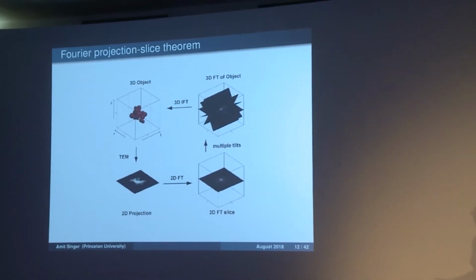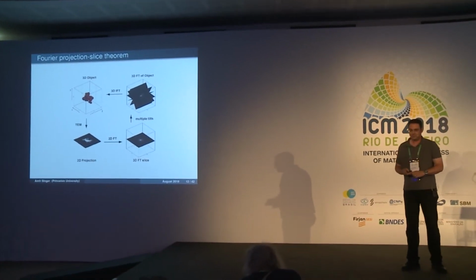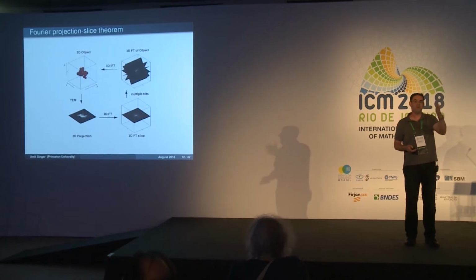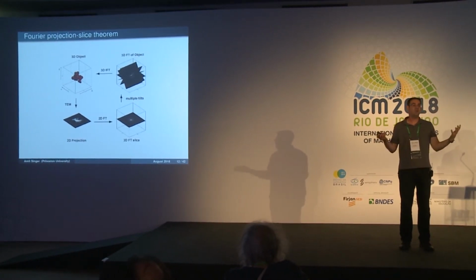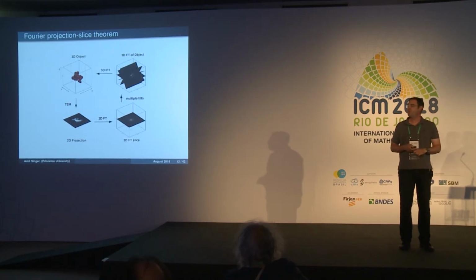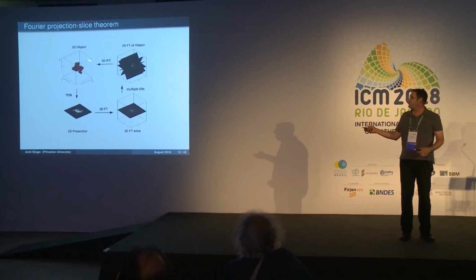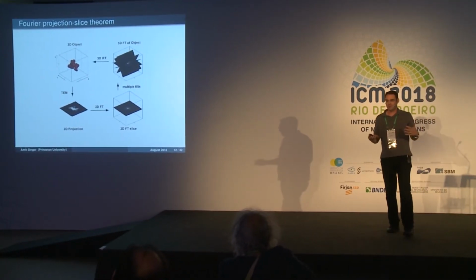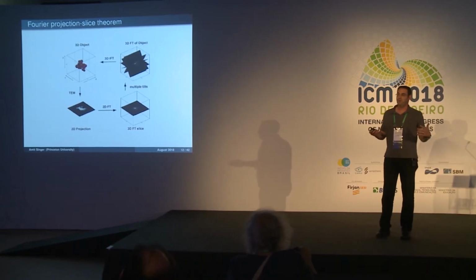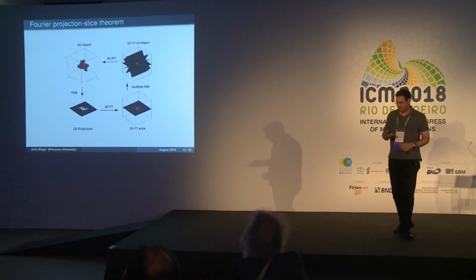So in classical computerized tomography, in CT, say medical imaging, the machine knows exactly the viewing directions at which it imaged a patient who was instructed not to move for the duration of the imaging process. You can collect those slices and then do 3D Fourier inversion and get the object in real space. But in cryo-EM, we somehow need to organize the geometry. All the images are scrambled. We don't know the viewing directions, and now we need to somehow order them.